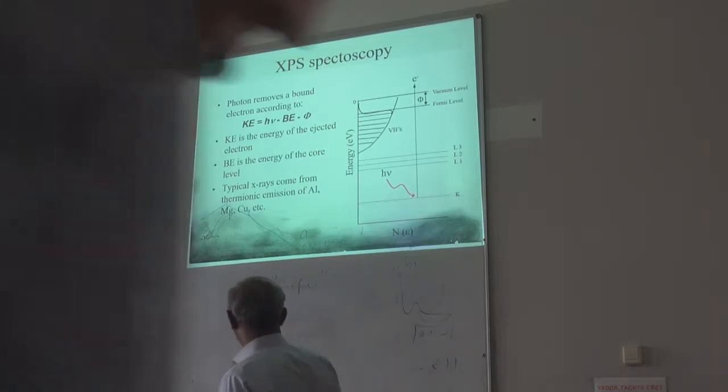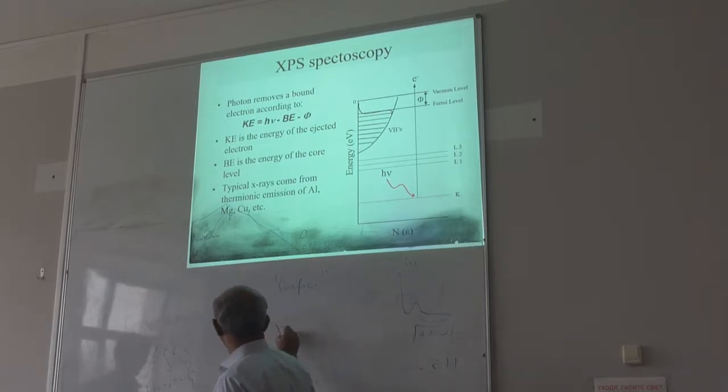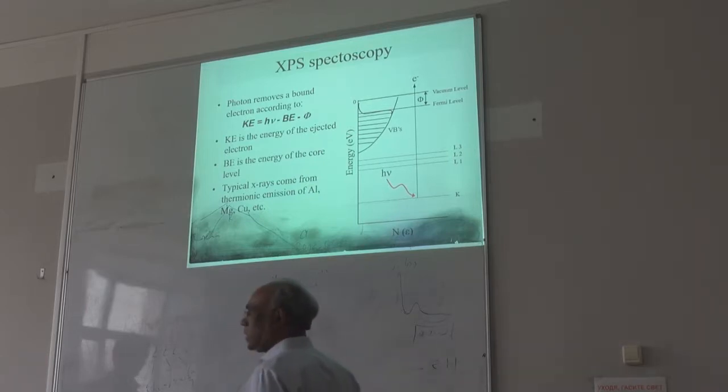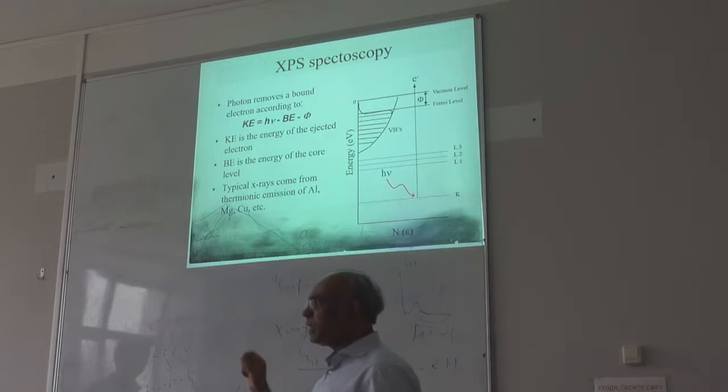So when we actually yields also has some surface properties that I'll talk about later. Now talking about the surface, to do this we use X-ray to shine on the sample. When you shine on the sample, again you are going to knock out some core electrons, right? So in XPS, we are directly looking at the energy of this outcoming electron.